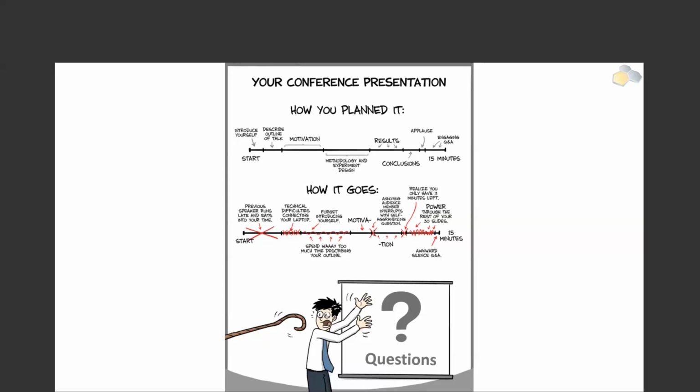More questions? Anybody who wants to use the tool, get more feedback, or ask about any other viruses? For example, has anybody looked at your end on the coronaviruses, or is it not something that you think there is enough evidence for so far?